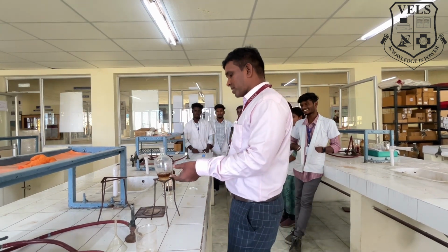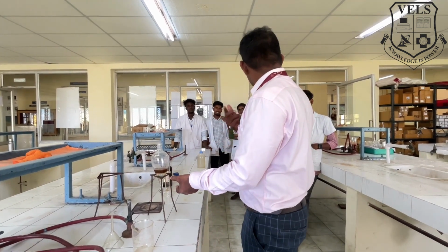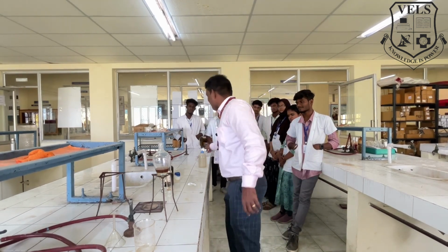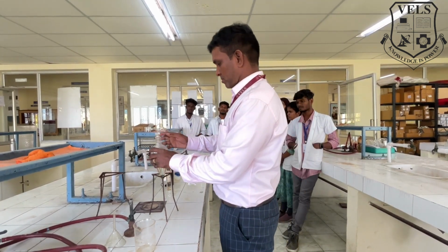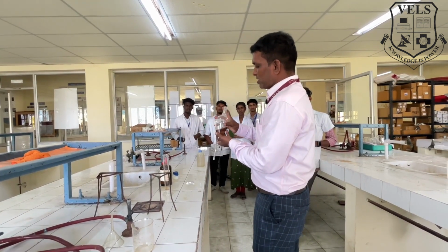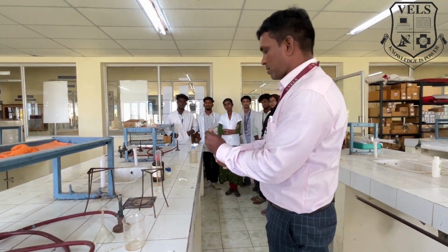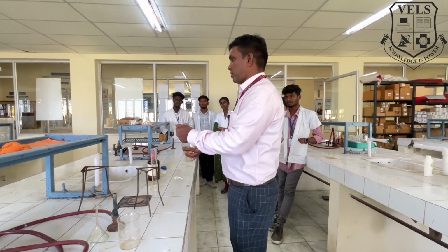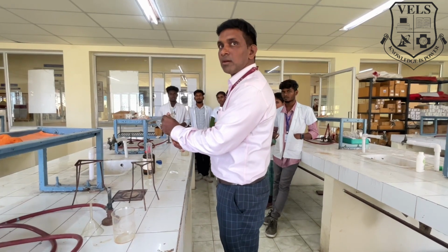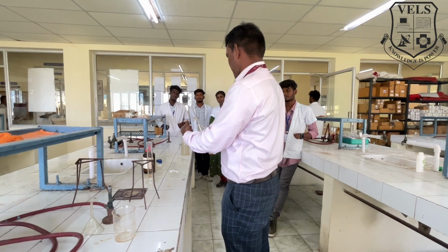When you compare it with water, this chlorinated solvent is higher in density. So the bottom layer is the chloroform layer, and the upper one is the aqueous layer. Now do the solvent extraction. Hold this tightly and release the pressure. Release the pressure and do the solvent extraction process.